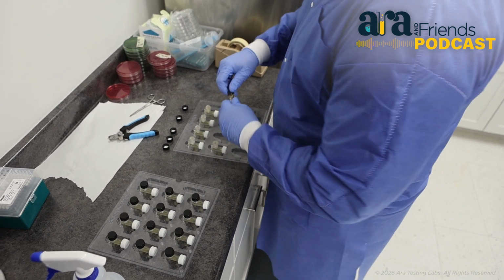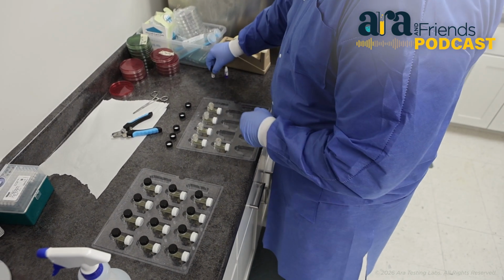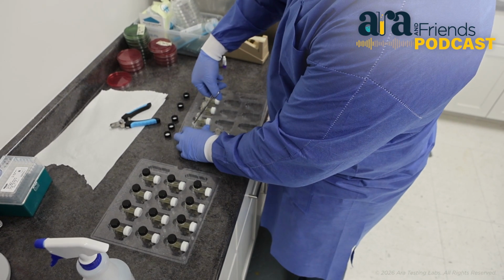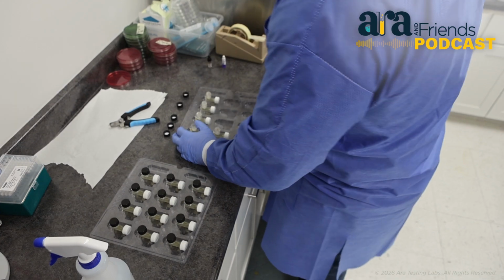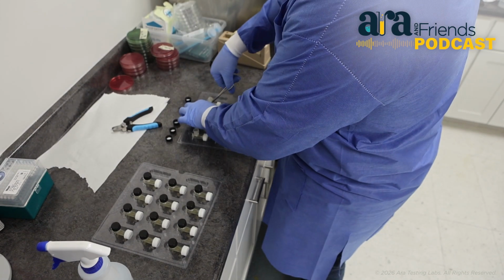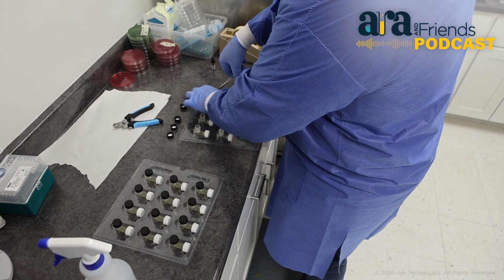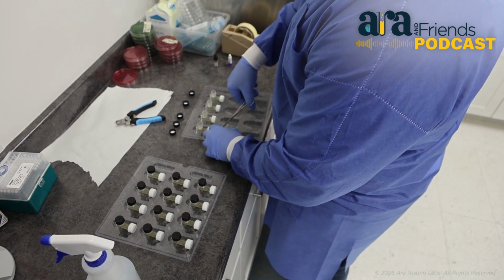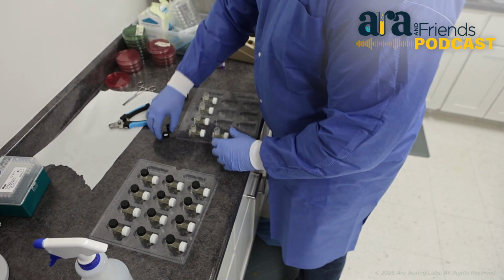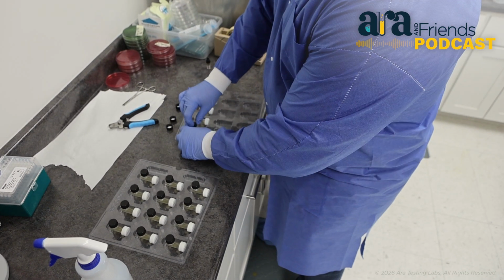Just one drop apiece. And with this little funnel, it ensures your iodine gets down into your 1-2 test all the way. Black cap back on.